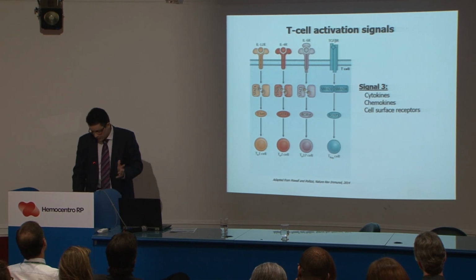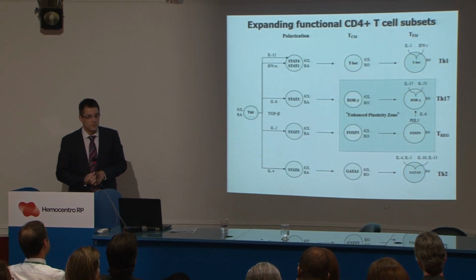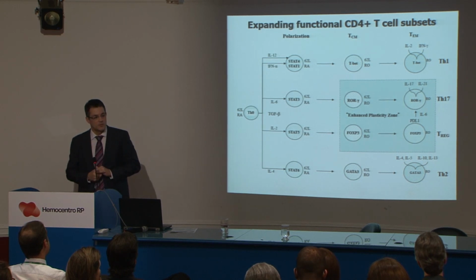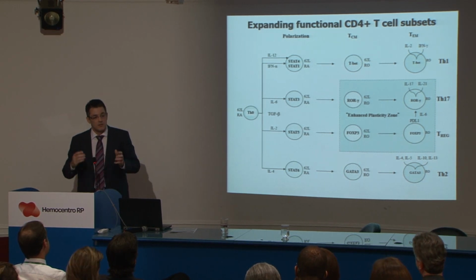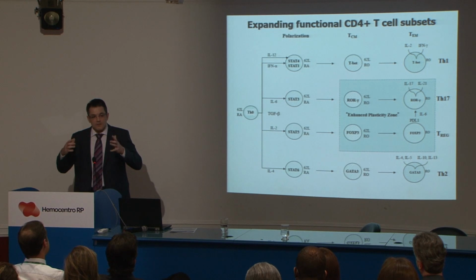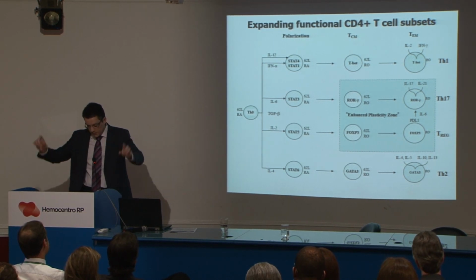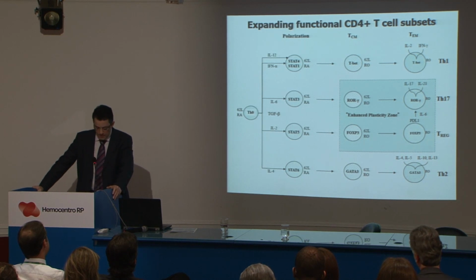So I can give you a recipe based on that principle. Is that what I have in my mind every time when I design experiments? Basically, based on the type of cells I want. So let's see the first on the top. I have some naive cells.